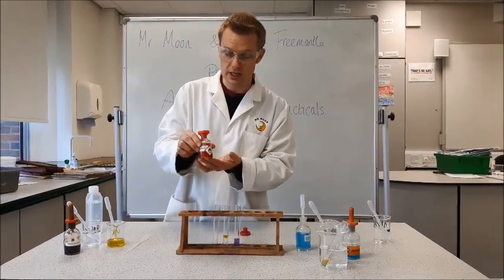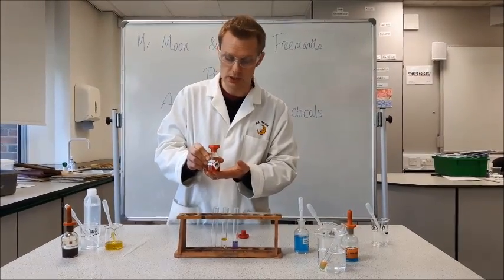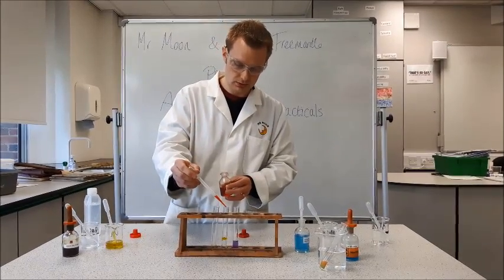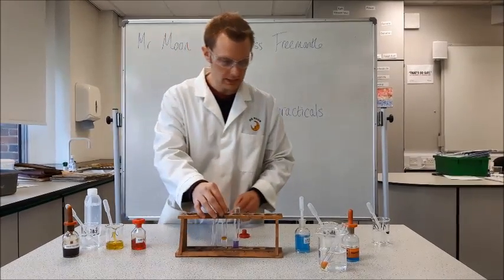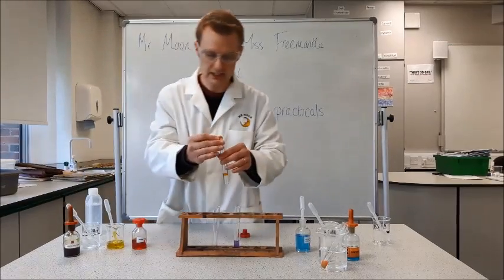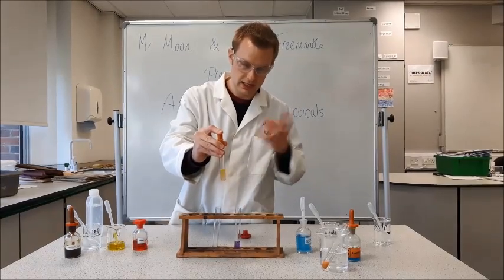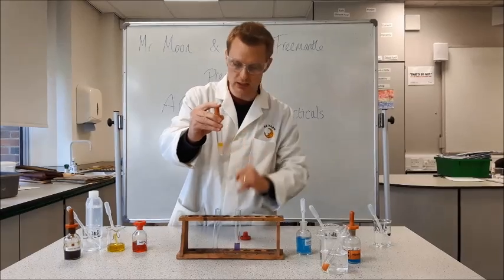Sudan 3 is the reagent we're going to use. It's highly flammable, so when you're doing your risk assessment make sure you mention that — you must keep it away from all sources of ignition. I'm going to add a few drops, then place a bung in the top and give it a shake. What we're hoping to see is the red Sudan 3 reacting and adhering to the droplets of oil, giving us a nice layer at the top.